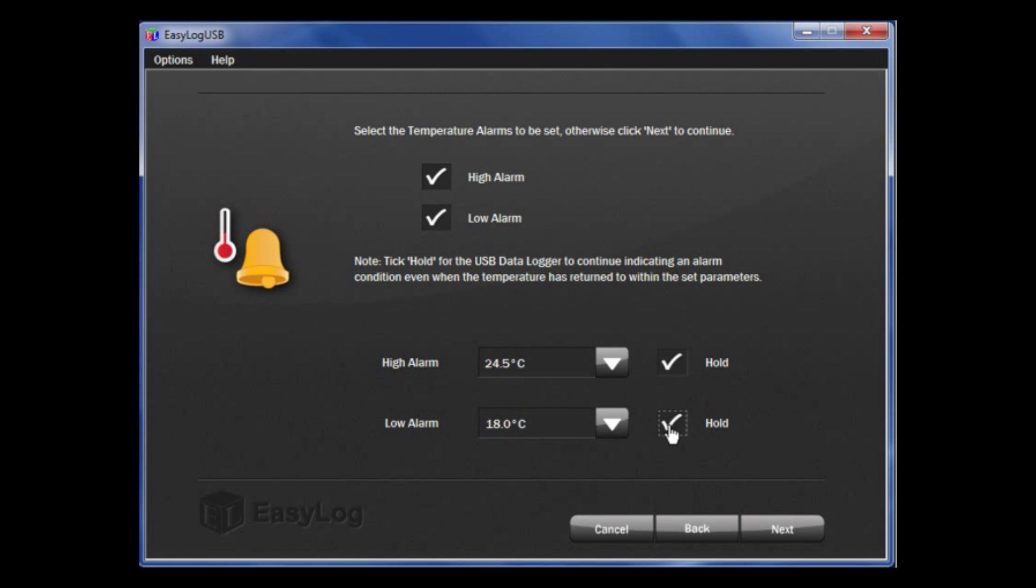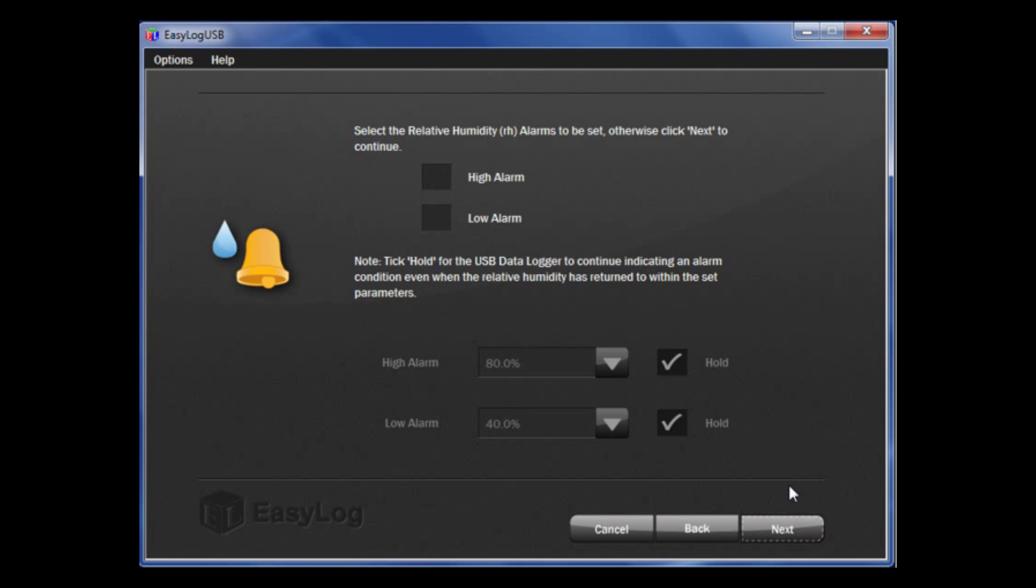If you wish to not set up temperature alarms, leave the boxes unticked and click Next. If it is a humidity logger, you can do the same for the relative humidity page, but I am going to leave these for the time being. If you are using one of thermistor probe loggers, there are options for the probe type as well. You just need to make sure that the selection matches the probe type you have.